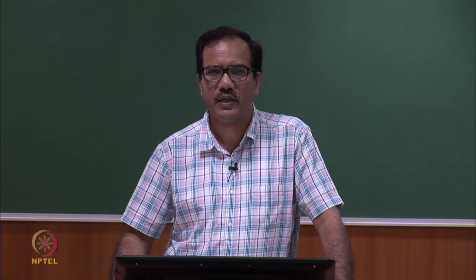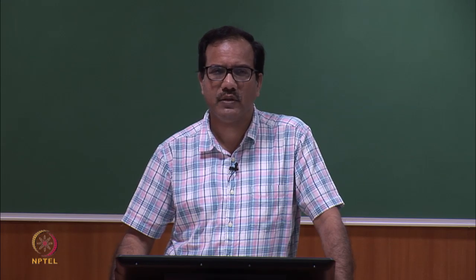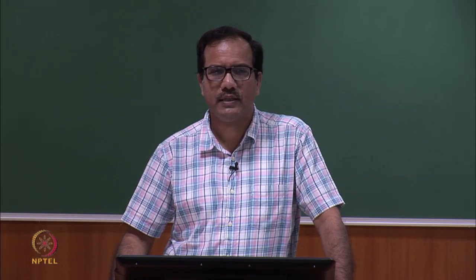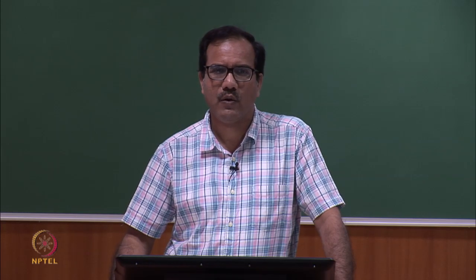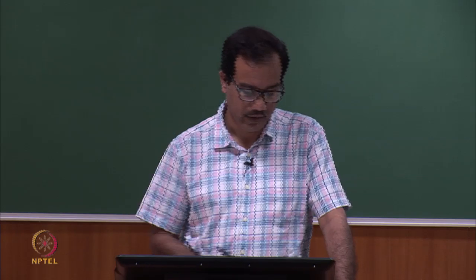In the last 3 lectures I was discussing the principles of NMR spectroscopy, and I started discussing how to get the structure of a molecule using NMR spectroscopy. I will continue with that, and then I will go to 2D NMR spectroscopy and let you know the potential of 2D NMR spectroscopy and how it can be used for elucidation of structure.